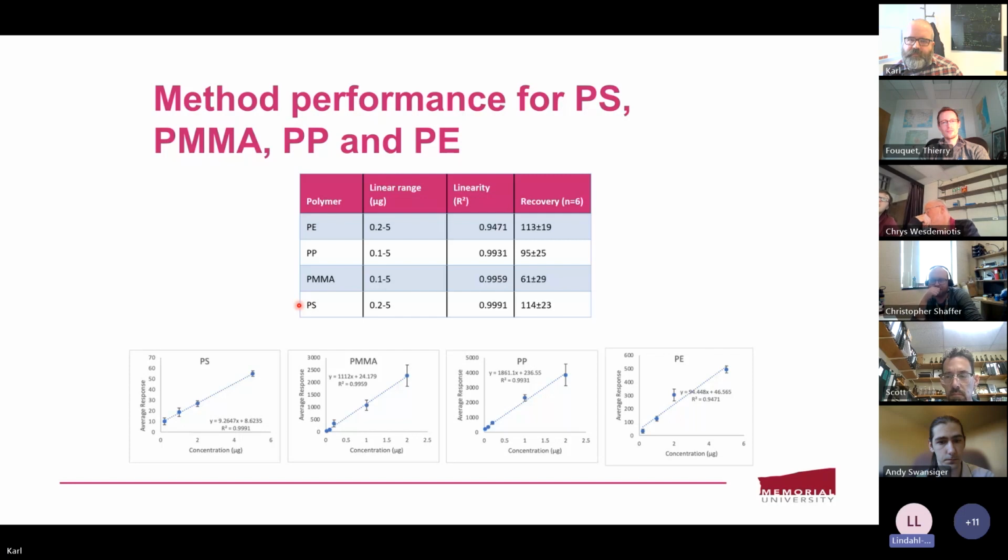And I'm curious how exactly the format of what's going into the pyrolysis tube is the same format, both particulate and extract, as the calibrants. So maybe you could walk us through the format that is the solvent mixture and how the sample was treated versus the solvent mixture and how the calibrants were treated.